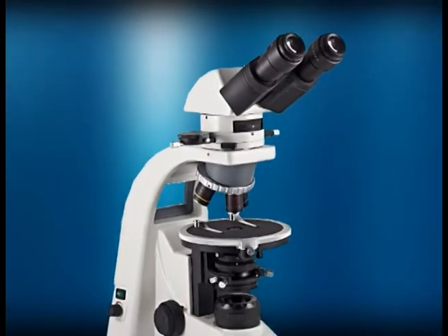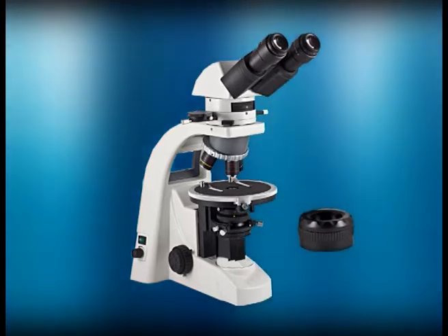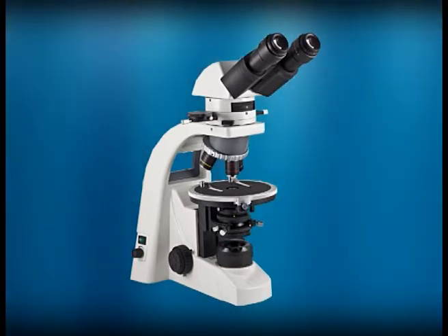The polarizer is a Nicol prism mounted in a circular metal case forming the bottom unit of the sub-stage assembly and is also called the lower Nicol. The polarizer can be rotated through 360 degrees and can easily be slipped from its mount or swung from the light path.